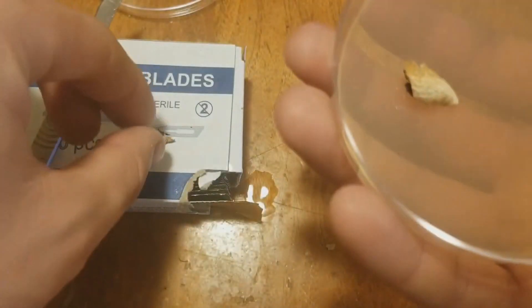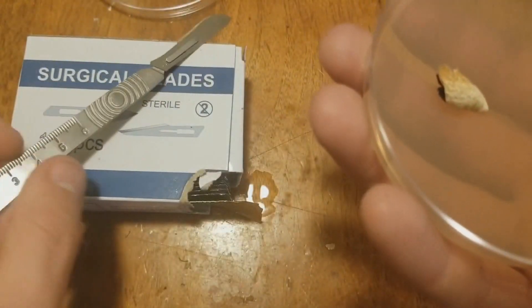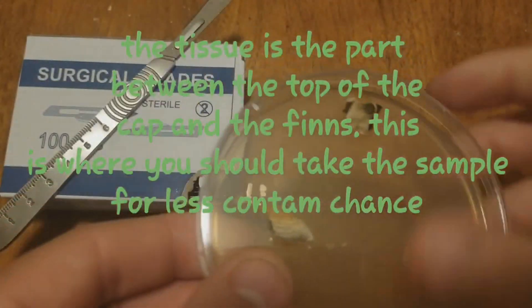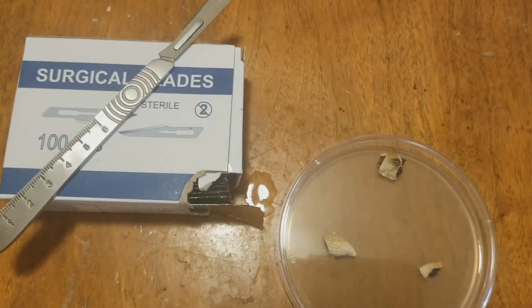This works a lot easier if you're using fresh mushrooms, and it's actually recommended that you use the tissue of the mushrooms. I'll try to show you the tissue between the mushrooms here — it's hard with this type of dried mushroom.